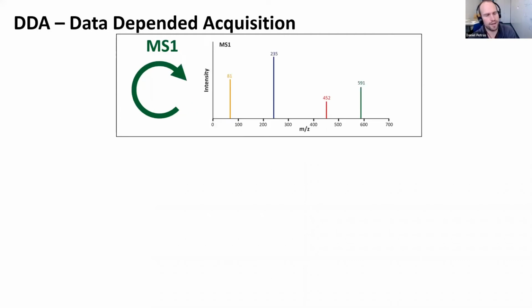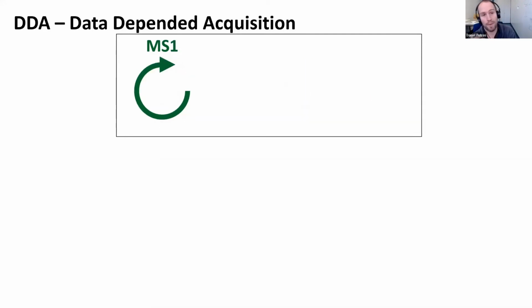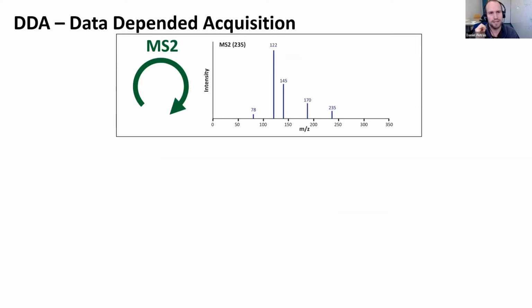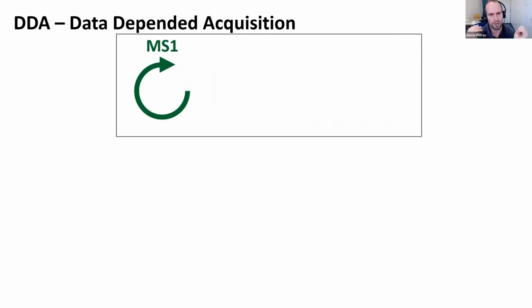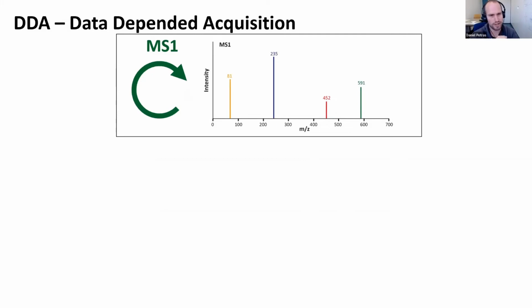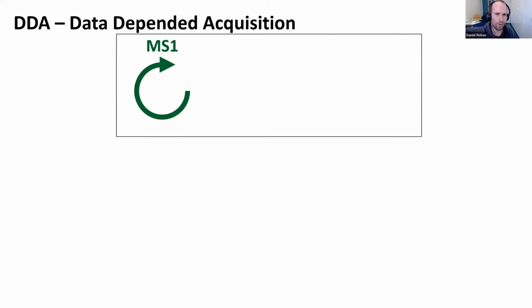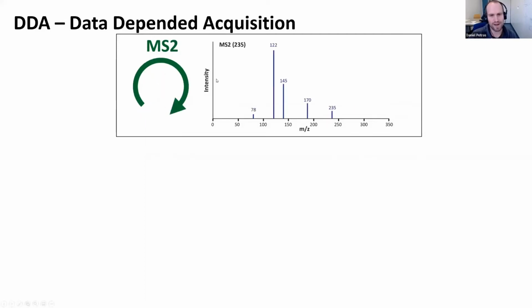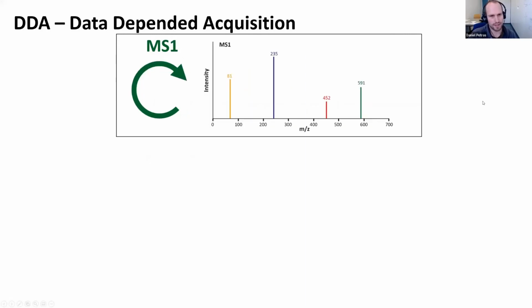You can put different conditions on charge state and on repetition, right? Once one ion is fragmented, you don't want to do it over and over again because you already have an MS/MS, so you can put it on a so-called exclusion list for a certain time. Then ideally this cycle rolls through your chromatogram, and you get a high coverage of all molecules that are eluting.